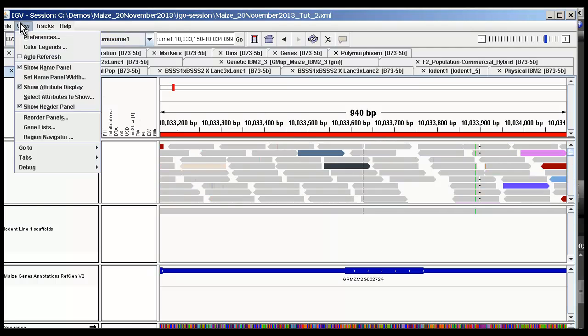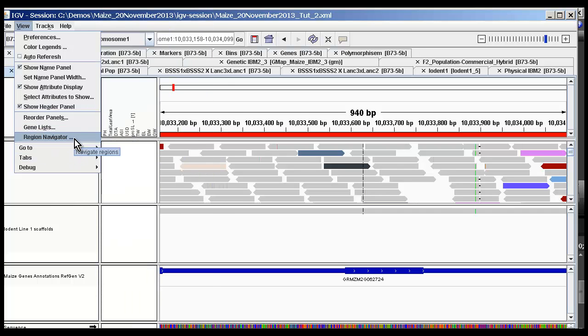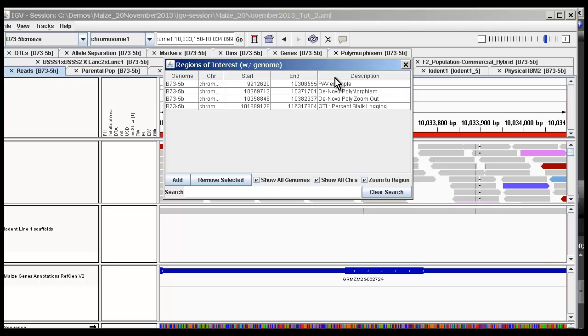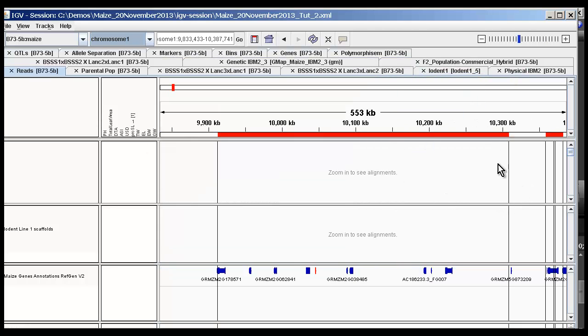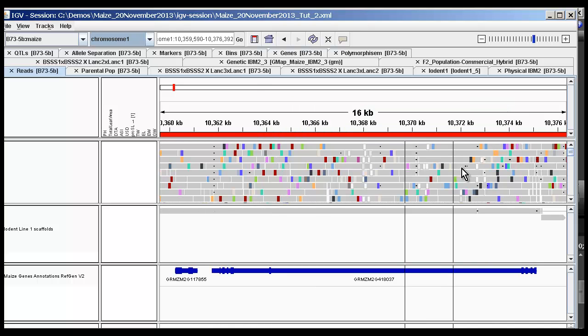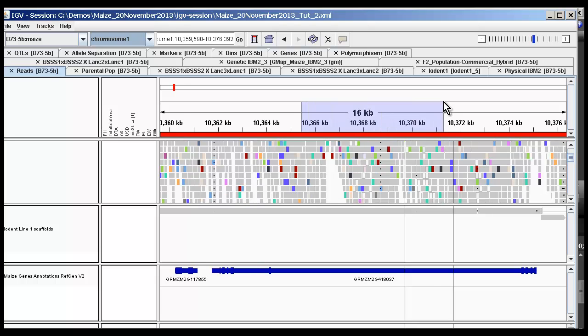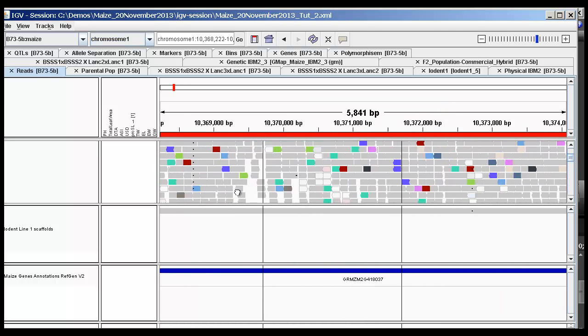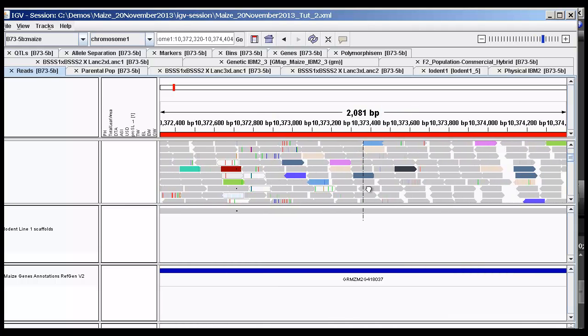I wanted to take you to a specific region that can demonstrate my point. If we go to this region, for example, and we concentrate on a specific gene, we can start seeing the many possible polymorphisms that are abundant in the alignment of the reads to the genome. However, as one can see, not all the polymorphisms are real.